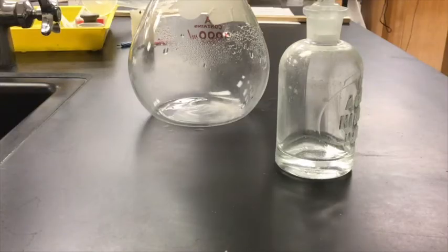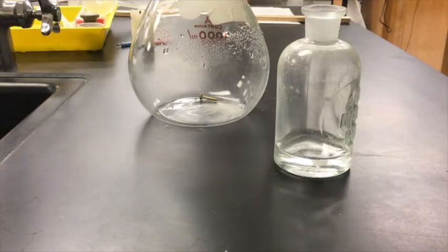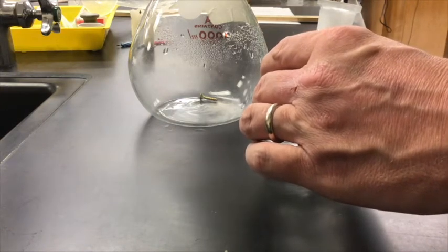Alrighty, so we're now going to try to dissolve this brass screw in some nitric acid. First things first, I'm going to go ahead and put the brass screw in there. Next, we're going to take the nitric acid, and after our calculations, we're going to need about 5 milliliters of it. So I'm going to go ahead and add in my 5 milliliters here.